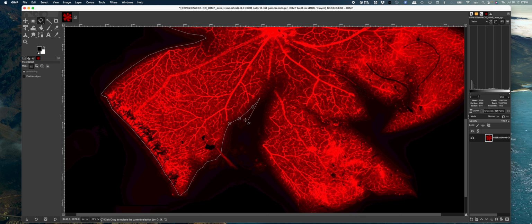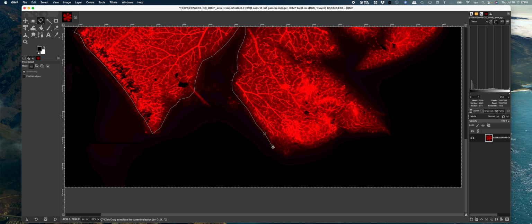Now there might be a little tissue you see back here glowing. That's really not from the retina, though. I can really kind of know where the retina is because I know that at some point this network was attached to here, and that's where it's been pulled apart. And if I want to go back a notch too, I can use my delete key and just back up a couple notches. I really want to kind of do this, I think, around here. I'm just going to hold my space bar and move again.